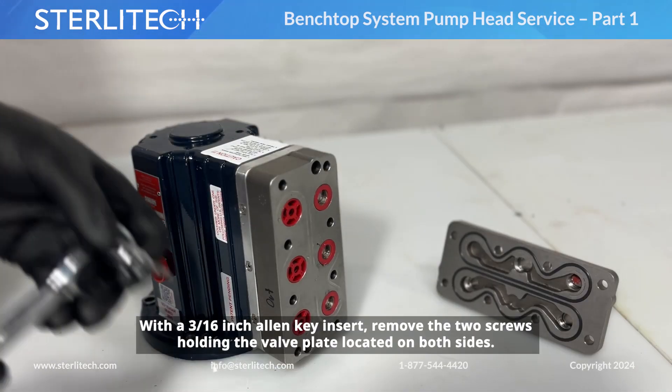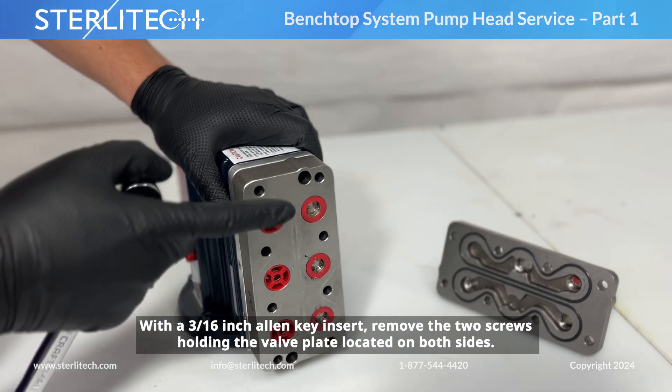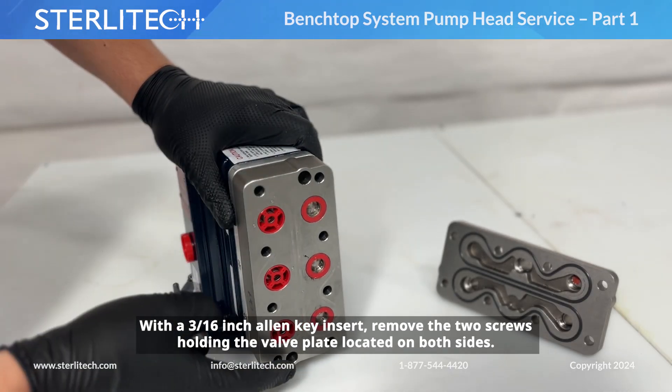With a 3/16-inch Allen key insert, I'm going to remove the two screws holding our valve plate, located here and here.